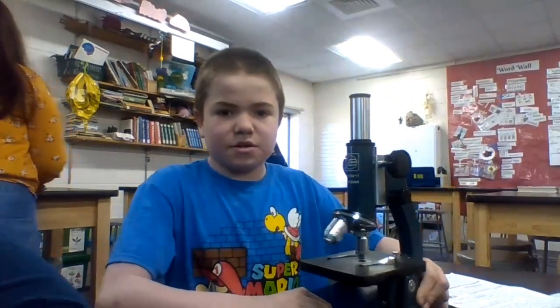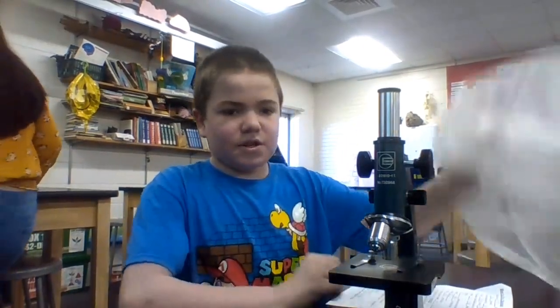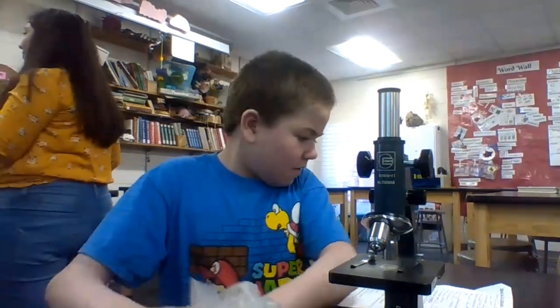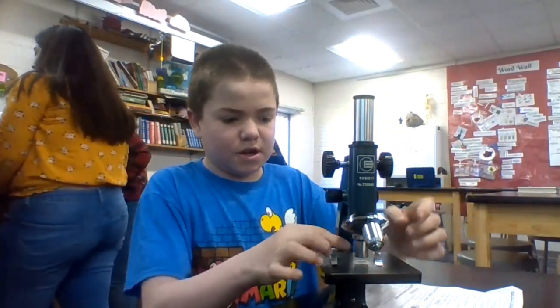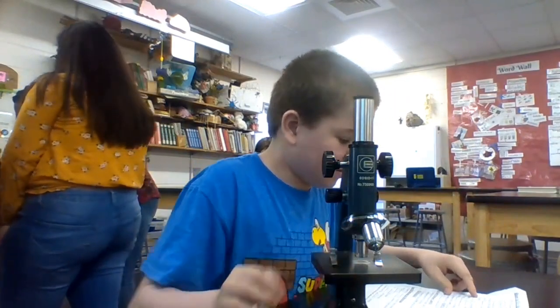Welcome to the Microscope tutorial. First you have to take the bag off and hold it by the base. You have to make sure the low power is down. Then you turn the coarse adjustment all the way down.